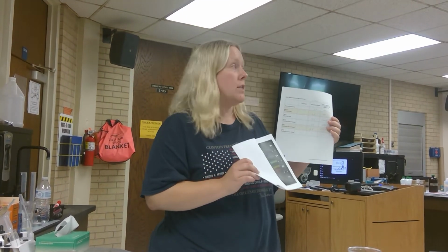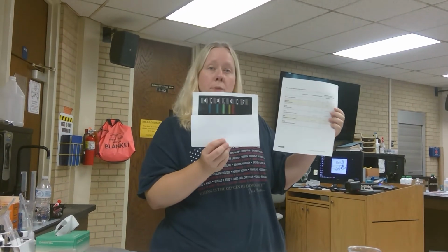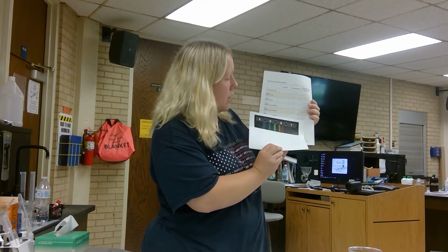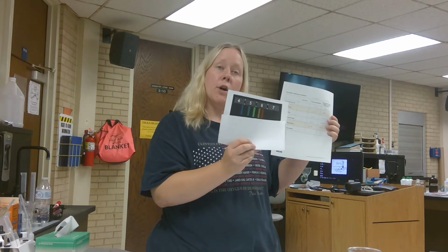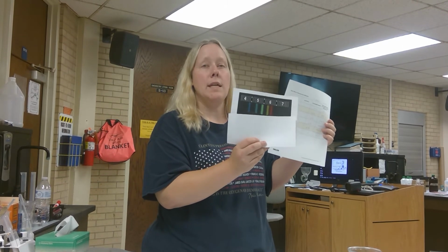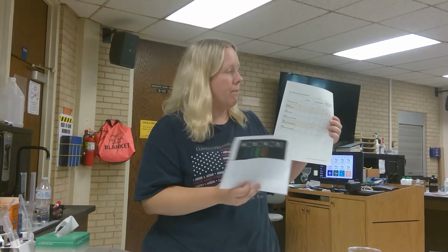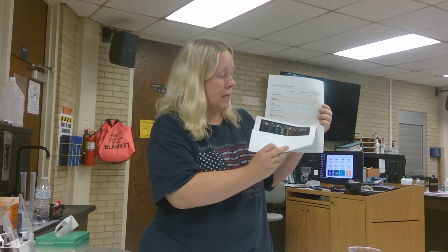But I saw more than 3 lines. I saw a total of 5 lines when I looked at the fluorescent light. So if this was my fluorescent light sample, I'm going to write down the other 2 lines. Purple is a very hard color to see. It blends in with the black background. So you may only see 5 of the 6 colors, or you may see all 6. But I want to see every line that you see, so every numerical marking here.